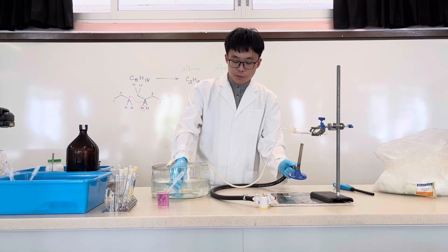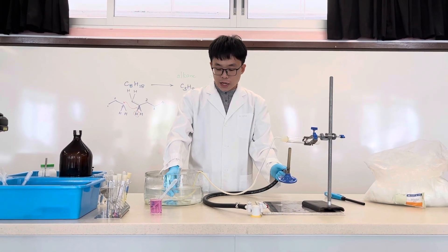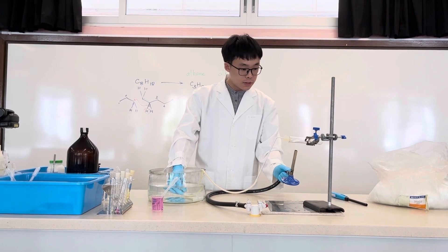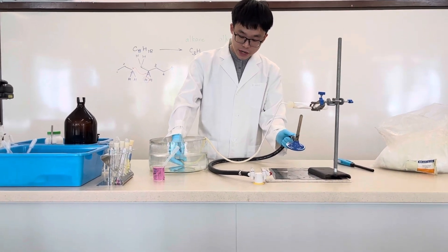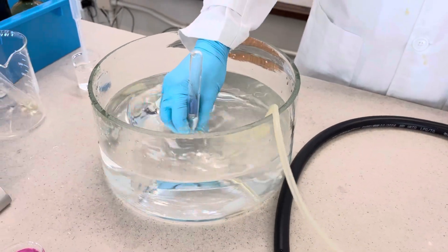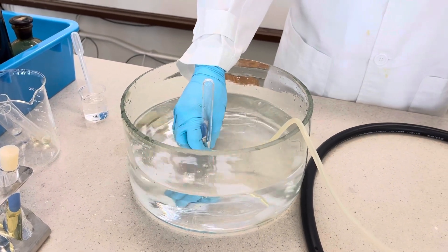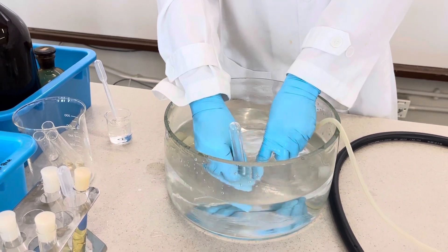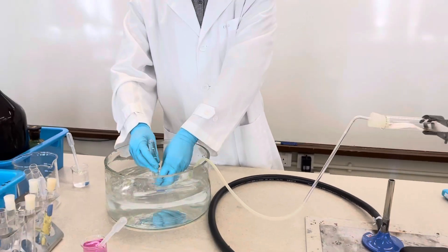You can see the gaseous product has been collected. Originally the medicinal paraffin is in liquid state. To boost production a little bit, we can heat for several seconds over the paraffin, then come back to the aluminium oxide. The first tube has almost finished collecting; we can change to another test tube and stopper the first one. We have finished preparing the first tube and will now collect the second.